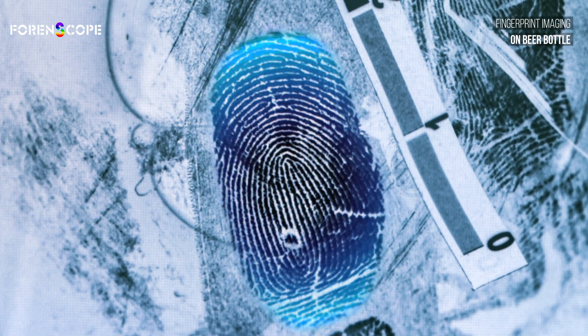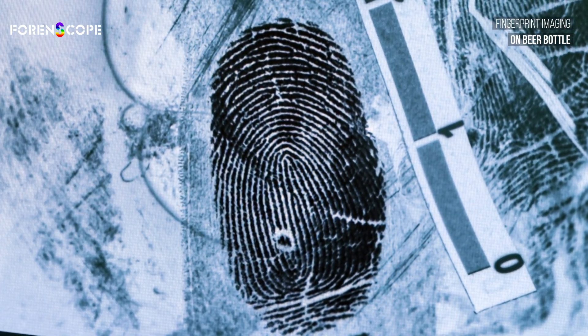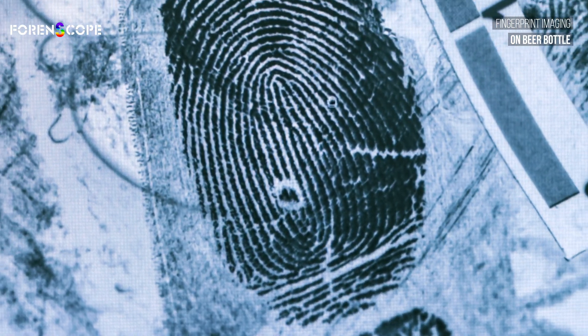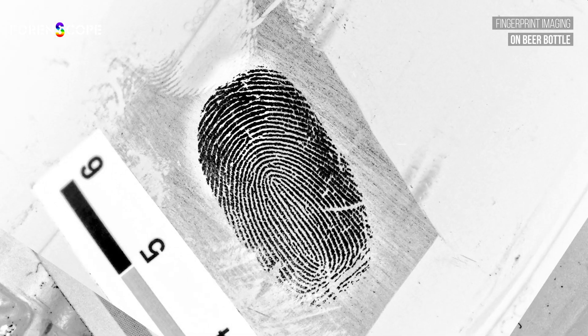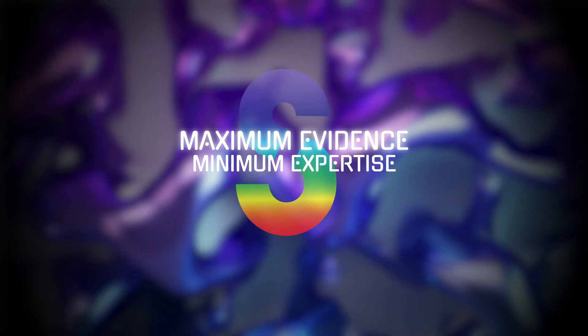With features like manual and one-touch autofocus and a precise zoom, it's the most advanced lab forensic device in the world. The Contactless Lab Ultra — the perfect blend of software and hardware. Maximum evidence, minimum expertise.